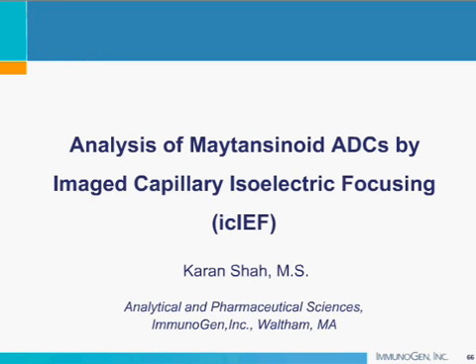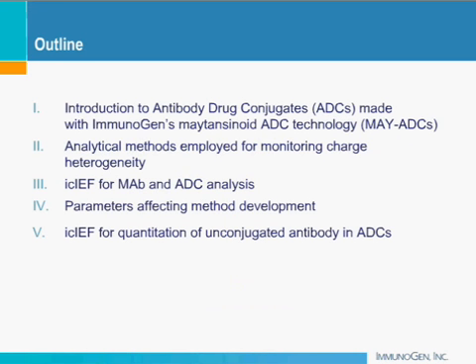I'm going to be talking about analysis of maytansinoid ADCs, that is antibody-drug conjugates, by imaged capillary isoelectric focusing. I will begin my talk with a brief introduction to antibody-drug conjugates made with Immunogen's maytansinoid ADC technology, and then move on to talk about analytical methods that have been traditionally employed to monitor charge heterogeneity, and then talk about ICIEF in general for antibody and ADCs and the advantages that it offers over the other techniques, and then some method development work for ADCs.